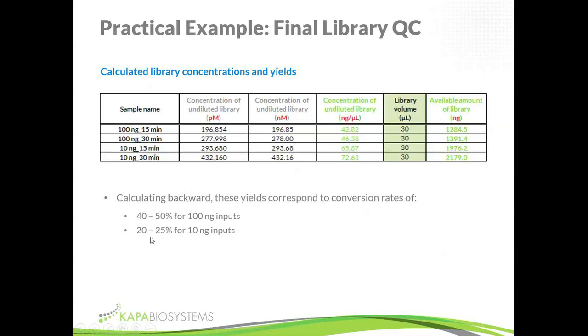And so the conclusion is that this worked really, really well first time off. If we have 100 nanogram inputs, there's probably no reason to optimize things much further. For the 10 nanogram inputs, maybe we can look a little bit at adapter concentration and see if there's a benefit if we use more, or tune down the amplification cycles if we don't really need all that much. But pretty much with standard conditions, it's possible to get a good approximation the first time around.